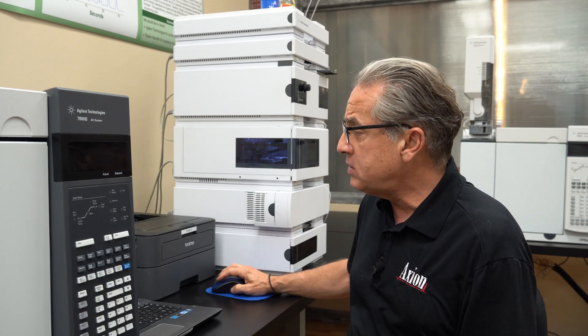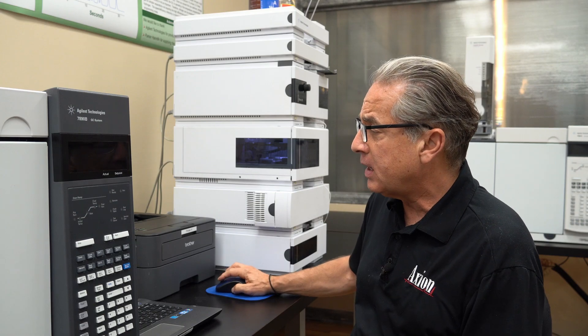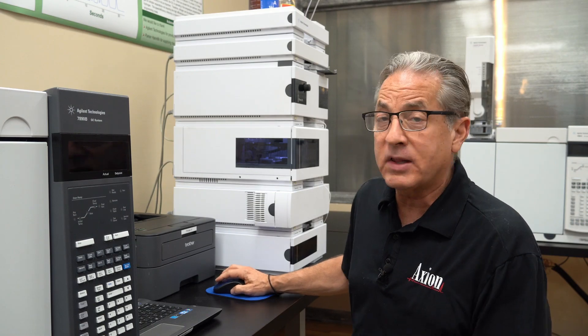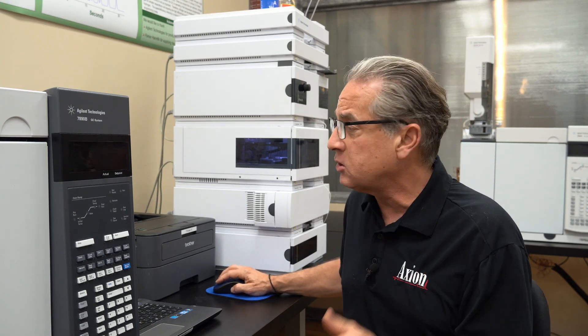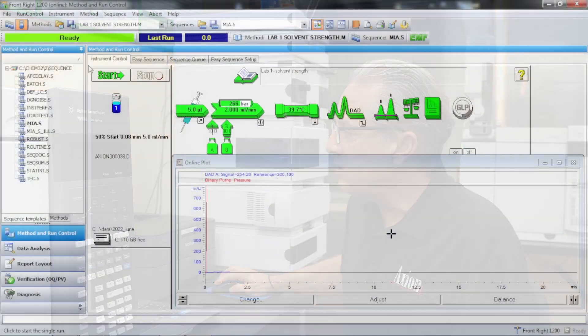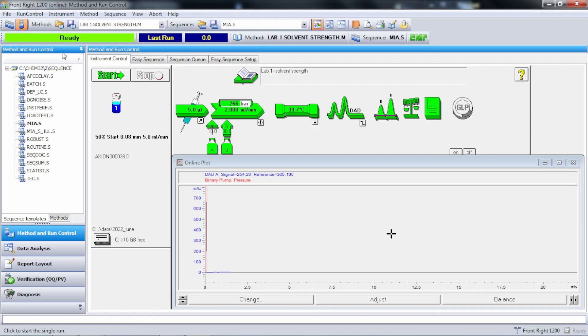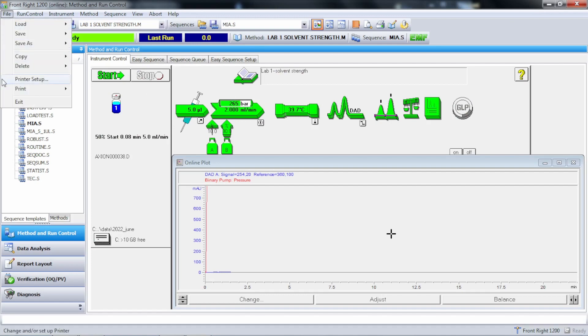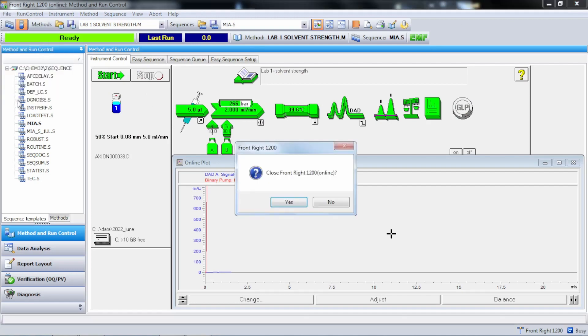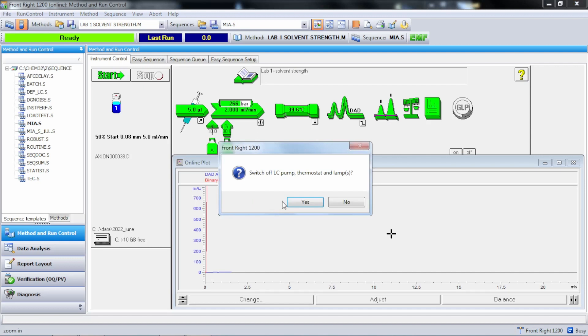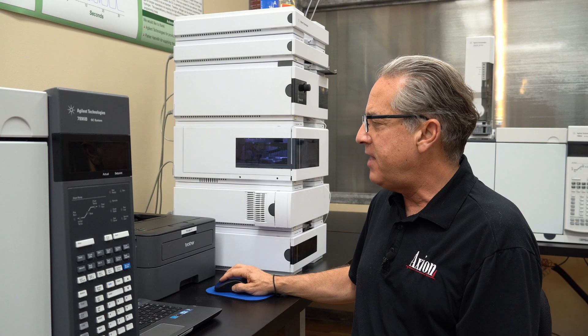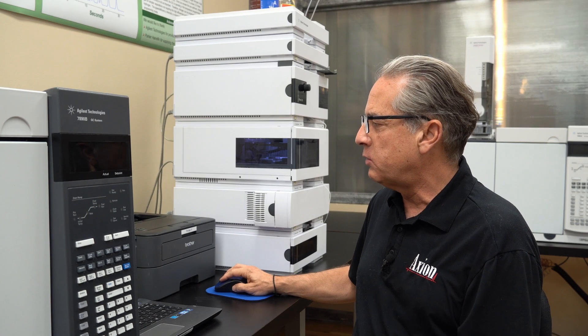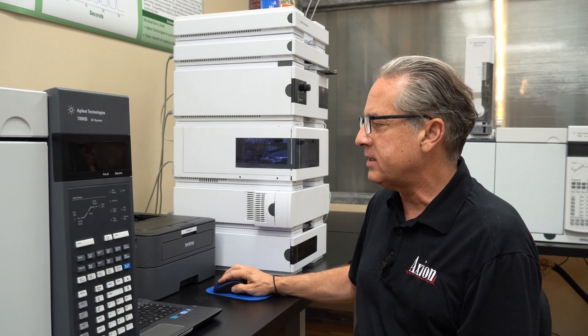So to use that software, first thing, it's called Agilent Lab Advisor. You get it for free from the Agilent website, but you first have to close out of ChemStation. And the reason is you can't have two devices controlling the instrument at the same time. We're going to leave the pump on and the detector on, and that's going to allow us to run these detector tests.